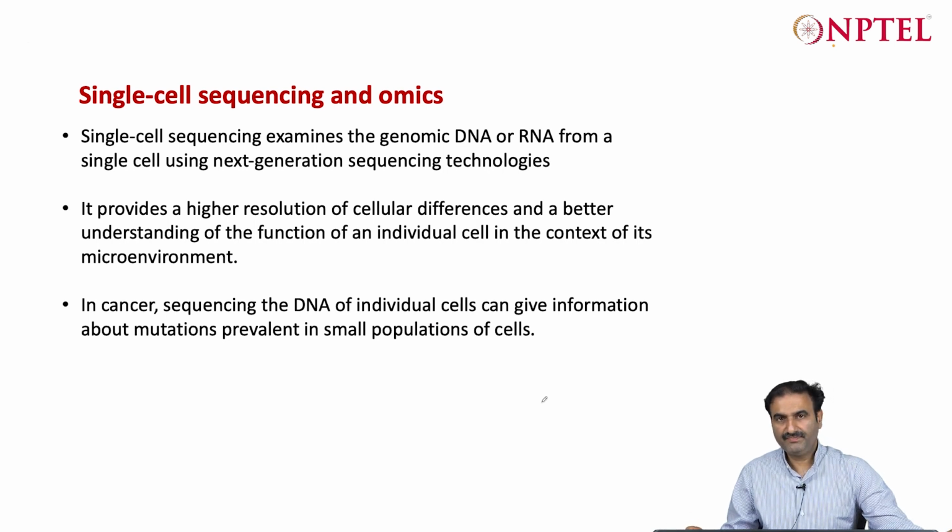Okay, so basically in single cell omics, we target the genomic DNA or RNA, and then follow the next generation sequencing strategies to sequence it to obtain the genomic content or the information on the transcript expressed genes, and that may vary according to environment, condition, or any treatment state, or longitudinal variations.